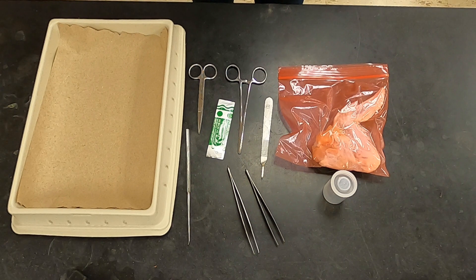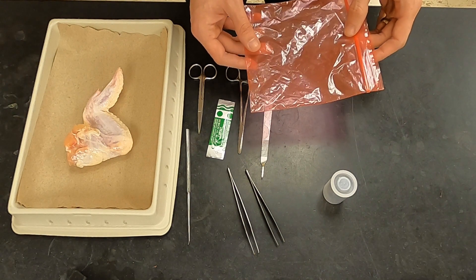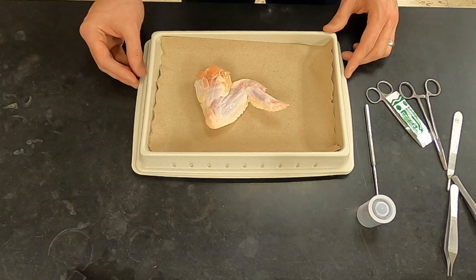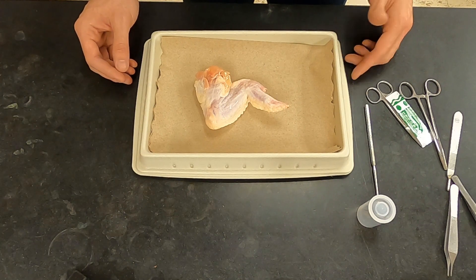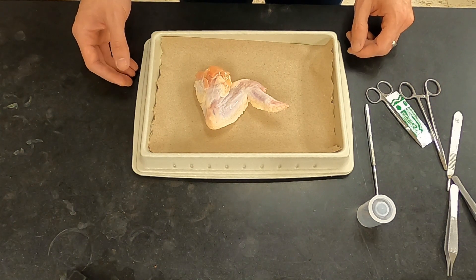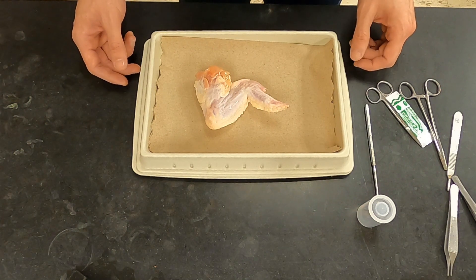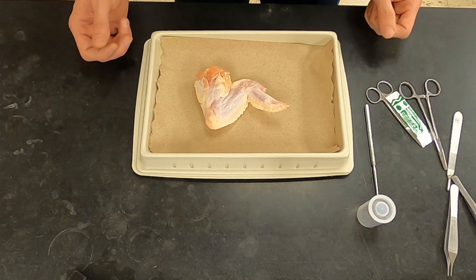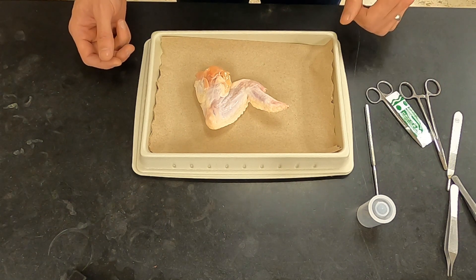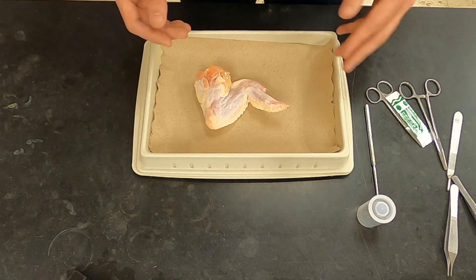The first step is to remove your specimen and put it into the pan to determine whether it is a right or left wing. Please save your bags for disposal of the specimen at the end. It's important to know whether you are looking at a right or left wing because the reference materials typically are going to be on a left wing, and so you don't want to mix up medial and lateral if you're looking at the wrong side. Most references that look at human arms look at right arms, so you'll really want to be paying attention to what is medial and what is lateral.